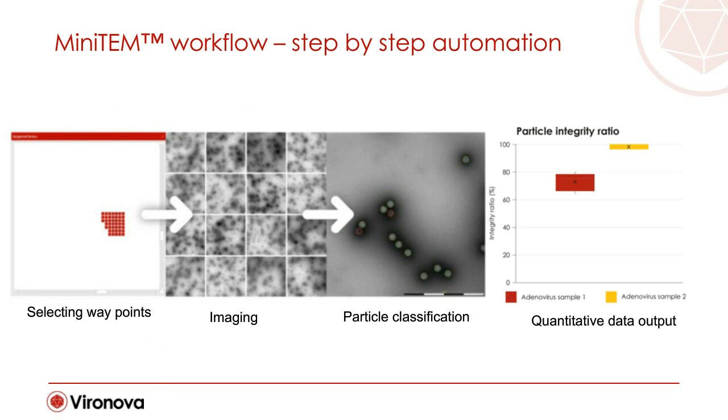The system moves from area to area and collects images at each area based on the user configuration. Each image is processed and particulate matter such as the primary analyte, but also undefined structures of interest, are registered and accounted for, so that we can perform automated classification, giving condensed metrics of presence and relative concentrations and distributions of, for example, size or integrity of the particles.